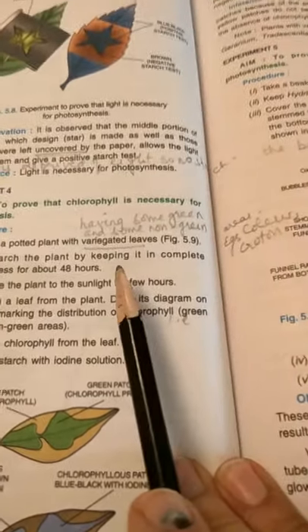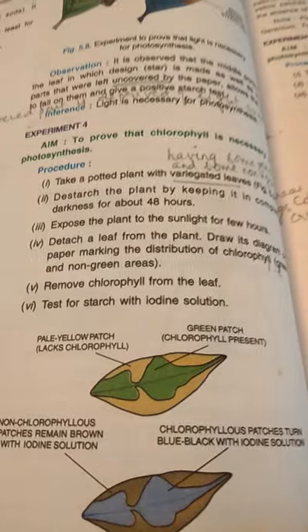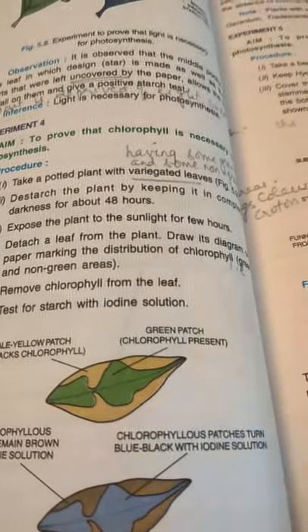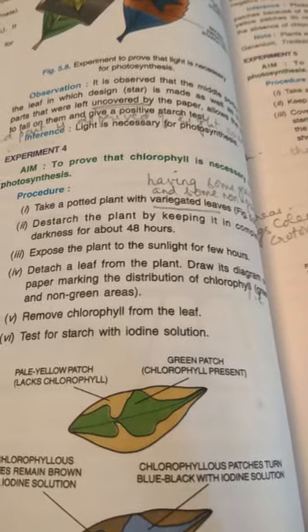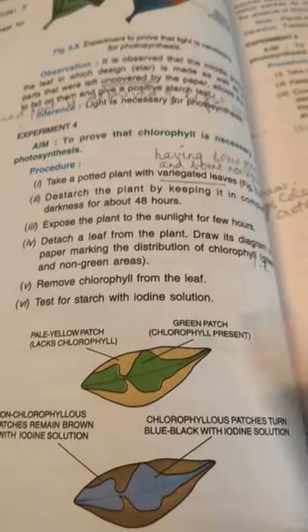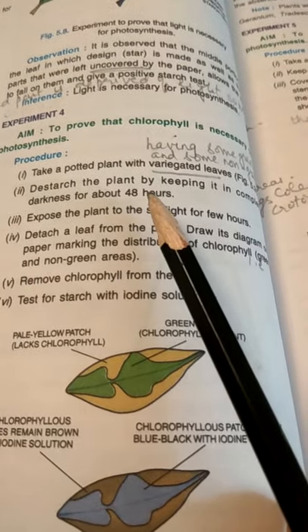Again we'll take a potted plant with variegated leaves. Variegated leaves means the leaves which have some green and some non-green areas — the leaf is not totally green; some part is green, some part is non-green or yellowish in color. An example is coleus or croton.